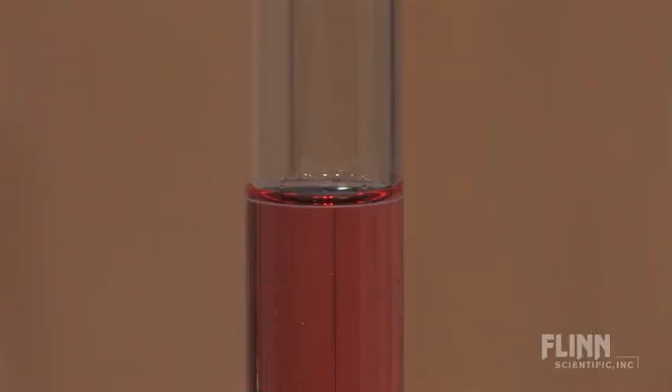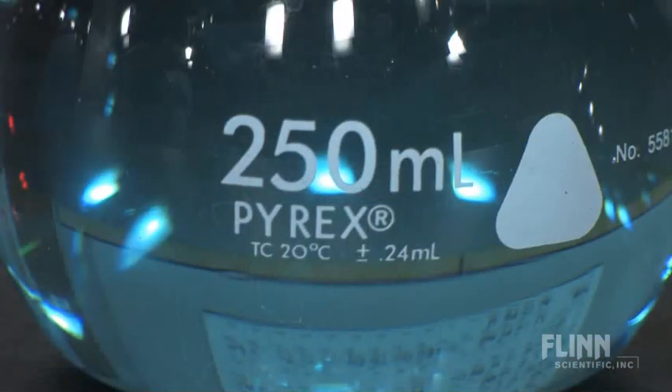The neck of a volumetric flask is marked with one line, which is typically referred to as "the mark," as in "fill the flask to the mark." Notice the flasks are labeled TC, or "to contain," and a temperature is listed.